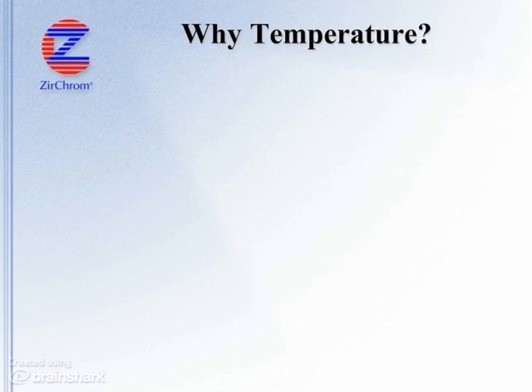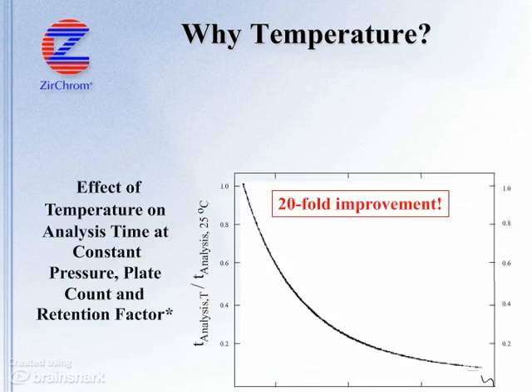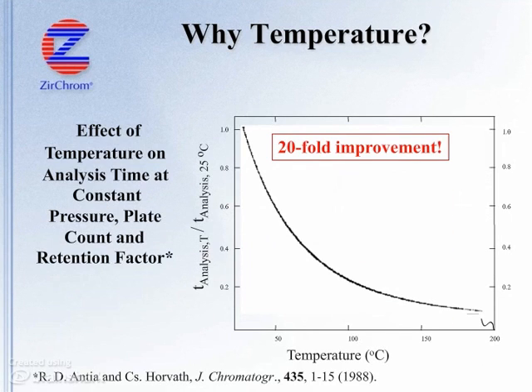Before discussing the practical application of elevated temperature, I'd like to touch briefly on why elevated temperature should be the method of choice for reducing HPLC runtime. The theoretical benefits of temperature were predicted in Antia and Horvath's seminal paper published in 1988. Shown here, the graph plots the effect of temperature on runtime while keeping all other factors, including retention factor, the same. The graph predicts a 20-fold improvement in runtime can be achieved without loss of resolution when the temperature is elevated from 25 to 200 degrees Celsius.